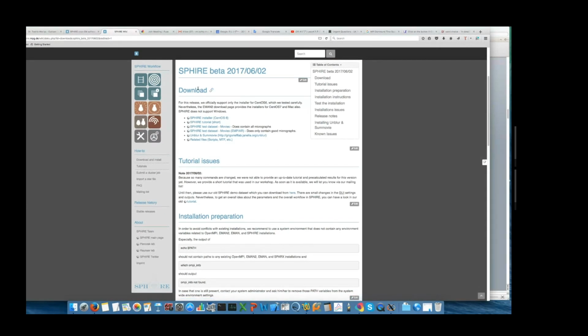This page contains an installer, tutorial, and a dataset. The tutorial and dataset are a very good place to start running Sphire and check it. This is where I recommend you look first.